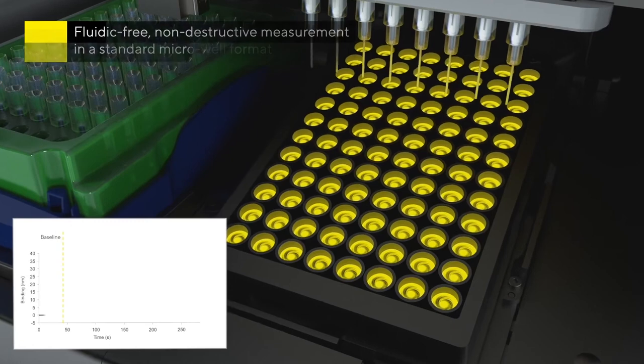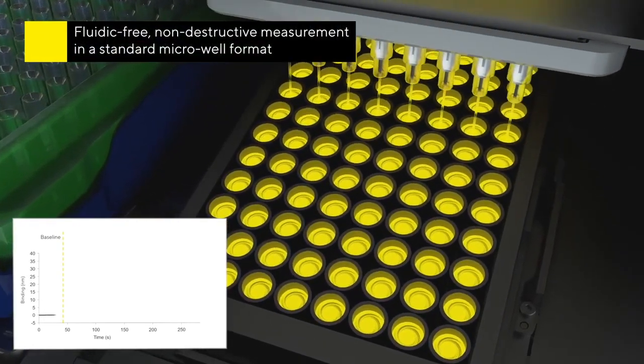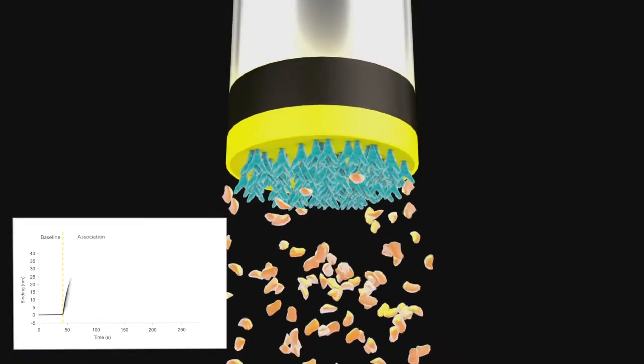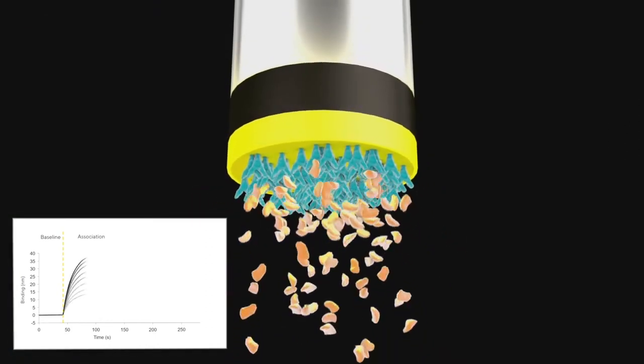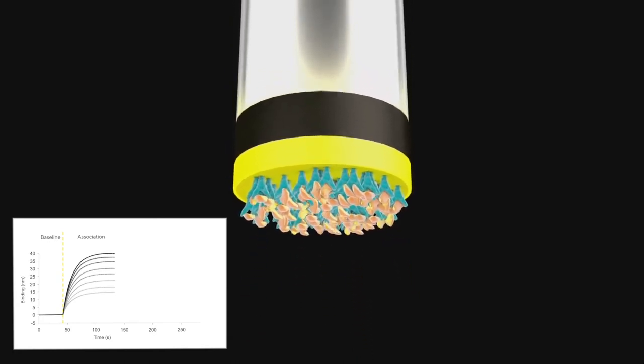The measurement is plate-based. An aqueous buffer is used to generate a baseline before the sensor dips into a sample containing the analyte. The analyte then binds to the sensor surface, and the binding interaction is followed in real time to reveal the association kinetics.